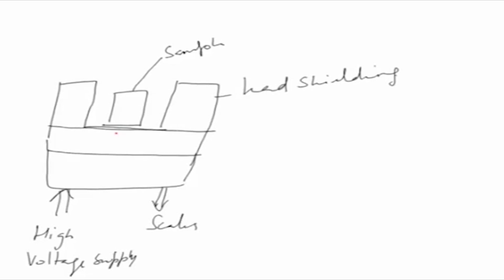Solid crystals of fluor are utilized and placed very close to the radioactive sample, and this will be the photomultiplier.